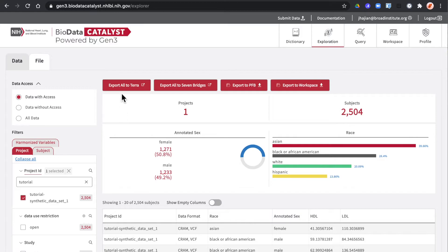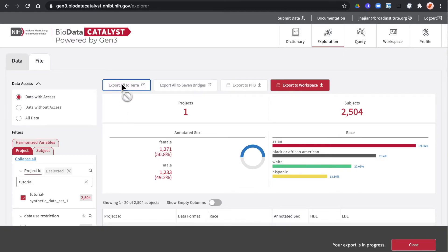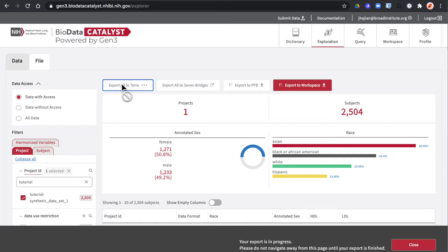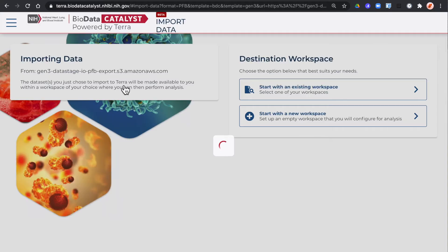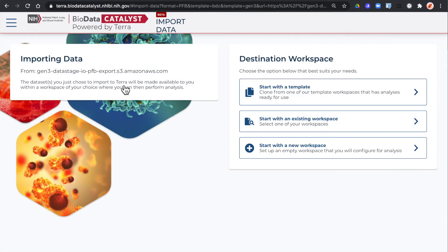You'll click on this red export all to Terra button. You'll get a warning message while the export's in progress. Could take a few minutes depending on how much data you have. When the export is complete you'll be redirected to this page to choose your destination workspace in Terra.